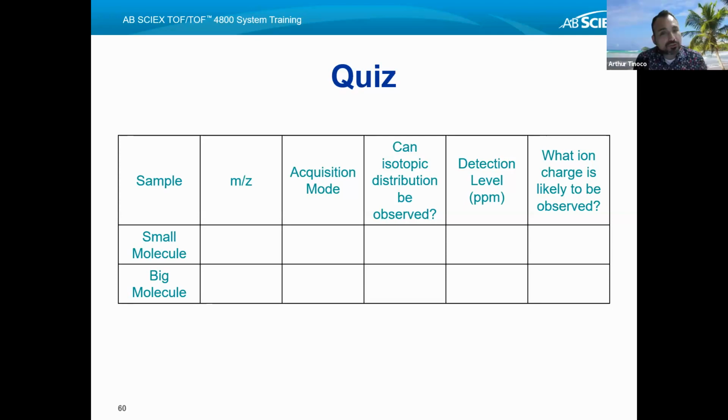No, never neutral molecules, not with this technique. So Bianca said plus or minus 2, but there's another set that you can see for big molecules in linear mode. Who can help her? Anna, you there? You can help her.